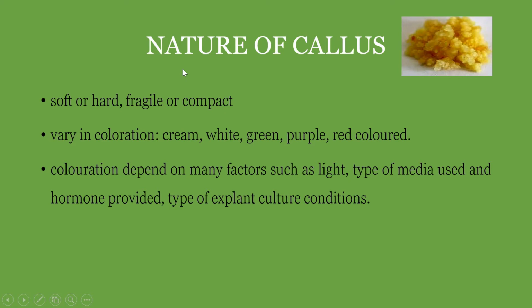So what is the nature of this callus? The callus may be soft or hard, that is, it may be friable or compact. It varies in coloration, it may be cream colored, white, or purple. This coloration depends on many factors such as light, type of media used, hormones which are provided in media, and the type of culture conditions.